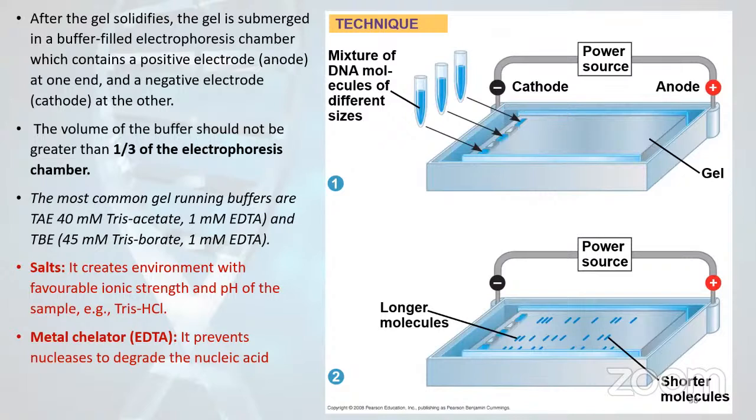All right, so as I have told you, the reason for these buffers to be present is so that they can support the conductivity in the gel electrophoresis. And the EDTA is present because it can prevent the nucleases from degrading the nucleic acid.